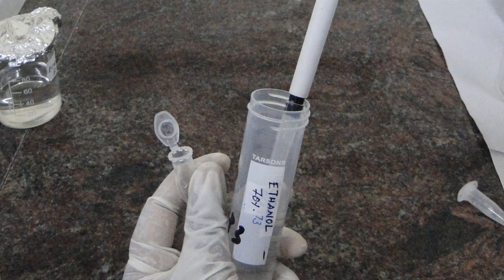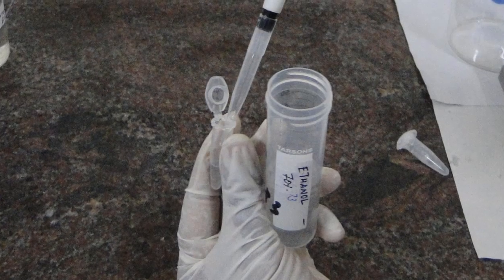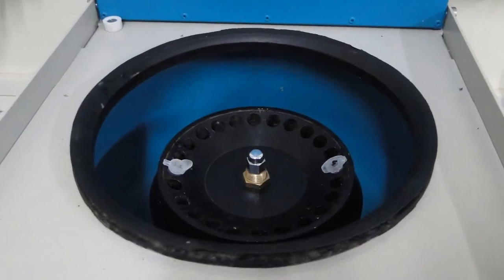Wash the pellet with 70% ethanol using a pipette. Centrifuge it for 10 minutes at 10,000 RPM.